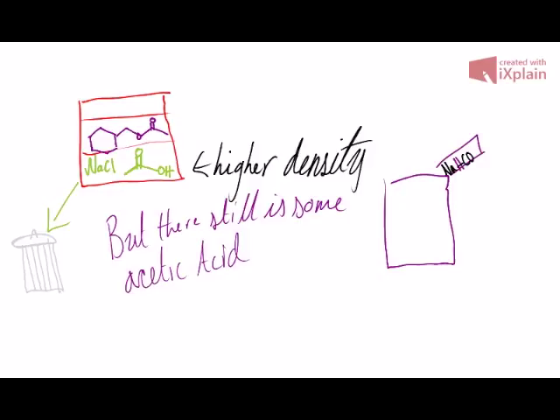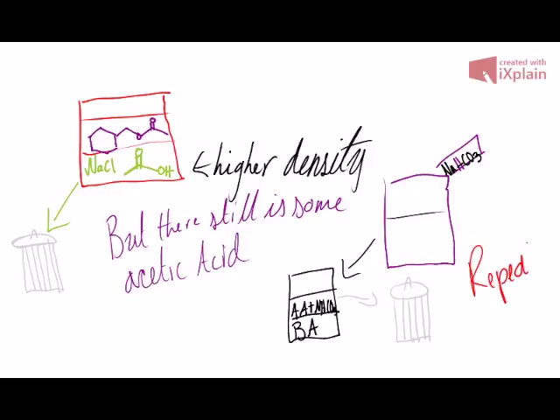At this point, the mixture should be only benzyl acetate and water. Magnesium sulfate was then added to absorb the water from the mixture. The magnesium sulfate and the water were then filtered out, leaving only the benzyl acetate as the final product.